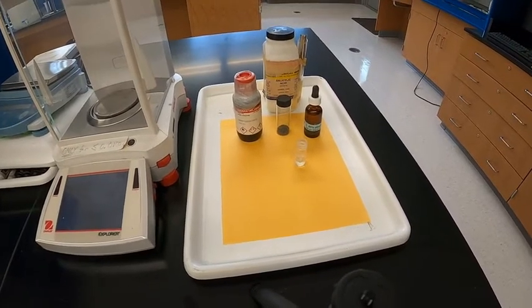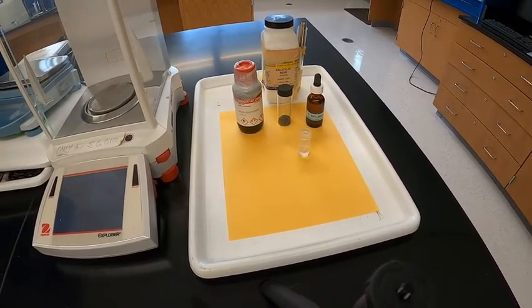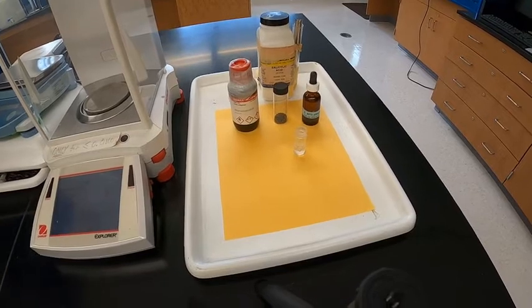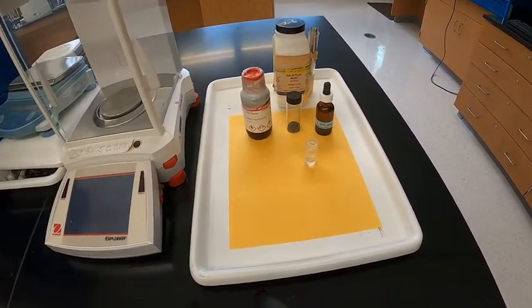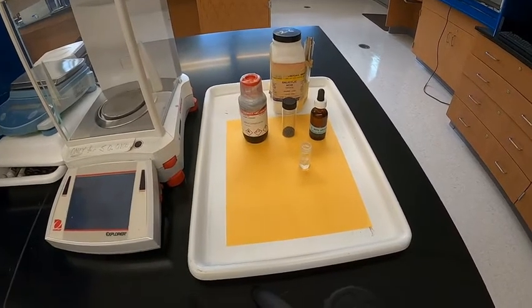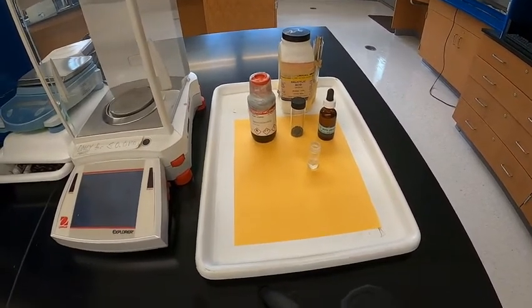The purpose of the boiling chip is that when we're heating up the sample, it provides real tiny nucleation sites. The boiling chips are just small bits of carbon, and those nucleation sites provide little spots for bubbles to form. Instead of getting one big bubble where the solution would bubble and pop over the top, we get a bunch of tiny bubbles, so the reaction heats in a controlled manner instead of potentially overheating or over bubbling and then losing your product or causing a big mess.